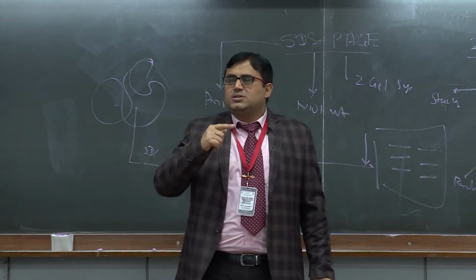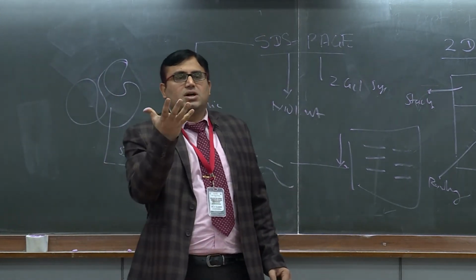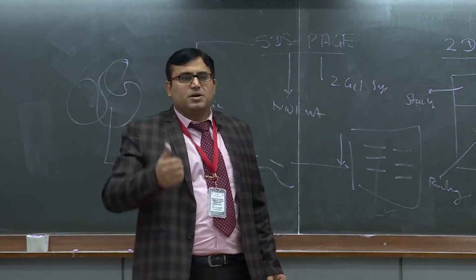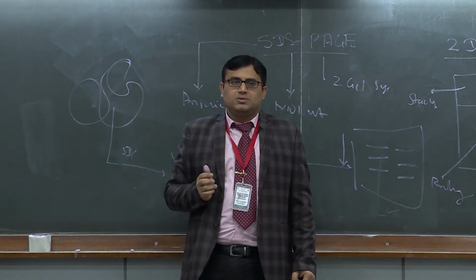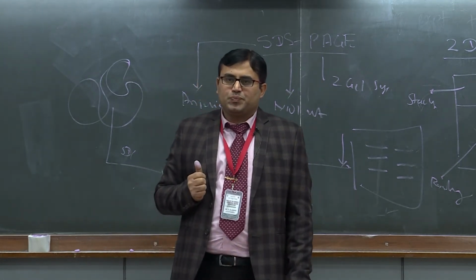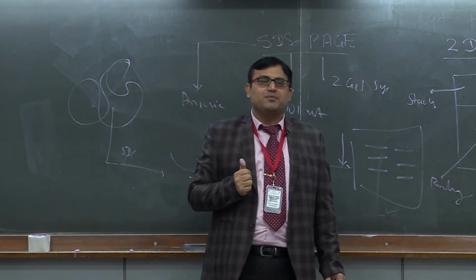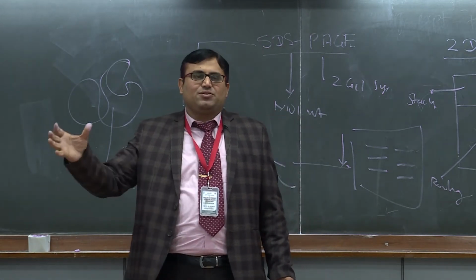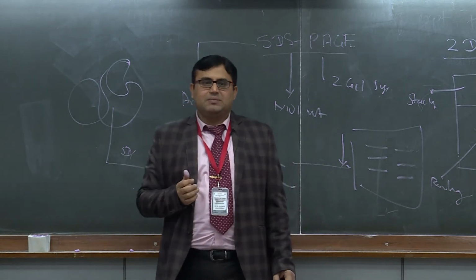Even if you fluctuate this by 2 digits, it will have an effect which is clearly visible on the band resolution. The band will not be clear, or there will be some other problem. So pH should be accurate as written here, and because of this it is also called a 3 pH system. It is also called the Laemmli system, because Laemmli is the name of the scientist who discovered this buffer and showed the running pattern of SDS PAGE. Laemmli's buffer system.